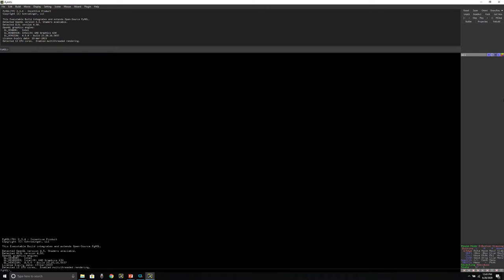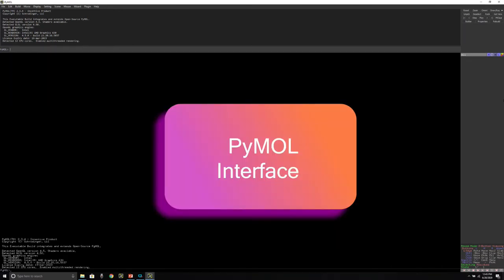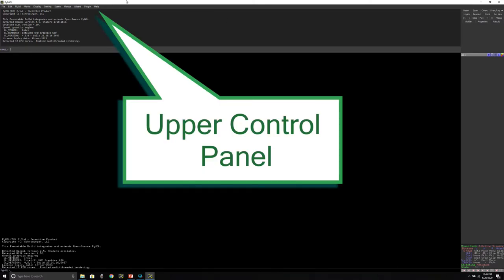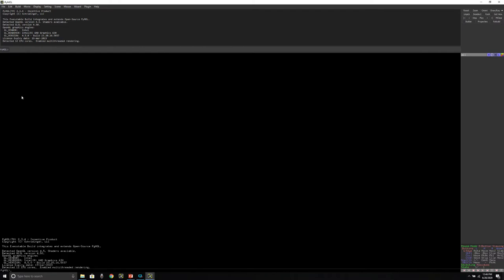Right now what you're seeing on your computer screen is the interface of the PyMOL software. At the top we have the upper control panel, which has a lot of options including File, Edit, Build, Movie, Display, and Setting — all with various sub-tabs we can use to make publication quality figures.